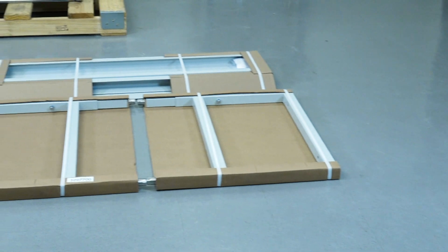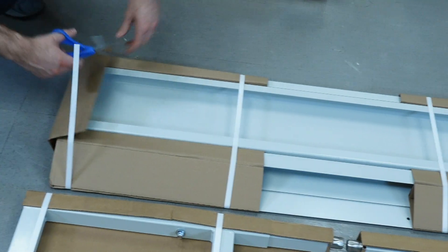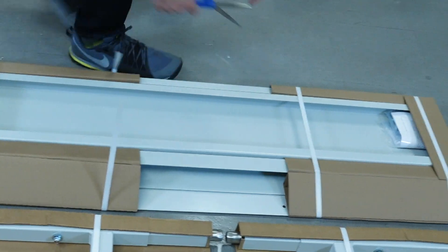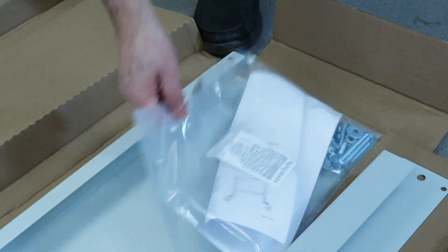Next, unpack the base stand components that were set aside during the initial unpacking. The base stand ships from LabConco at a working height of 30 inches, but it's adjustable up to a 37-inch working height in 1-inch increments.